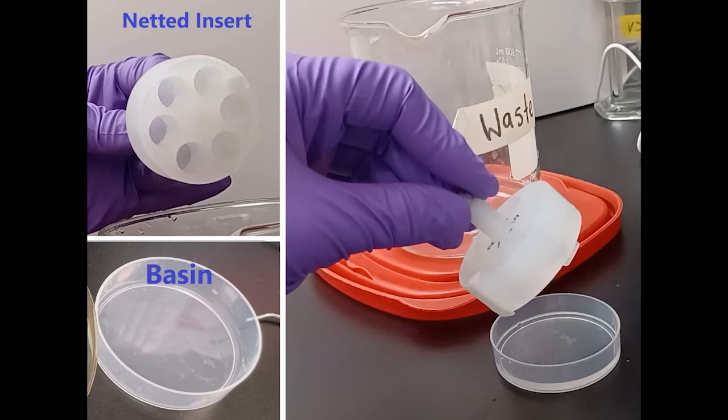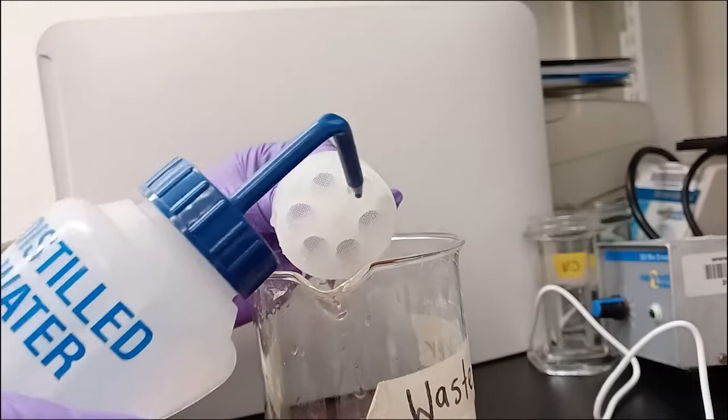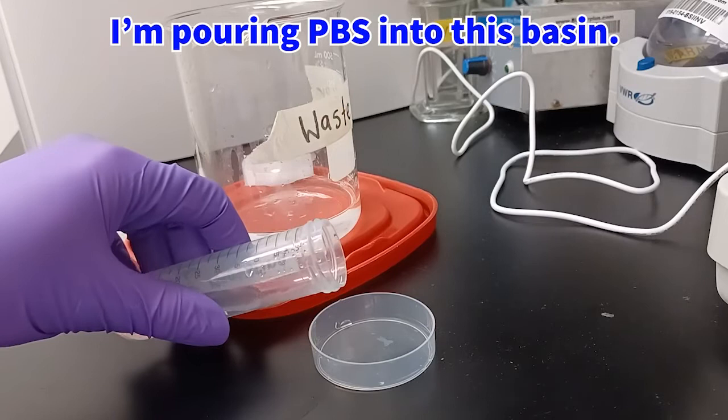Here are the staining tools you will use: the netted insert and basin. In order to make sure the basin is ready for use, it needs to have water squirted through it. If you try to insert it dry, there is a sort of hydrostatic repulsion that happens where the water won't actually go through the nets. So I like to squirt through it with a distilled water squirt bottle.